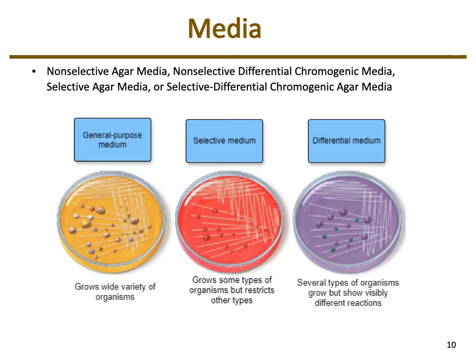There's also a number of coliform plates that you might have utilized, where if E. coli grows on it, E. coli has a green sheen to it. Again, that's differential because it lets us know what genus and species it is.